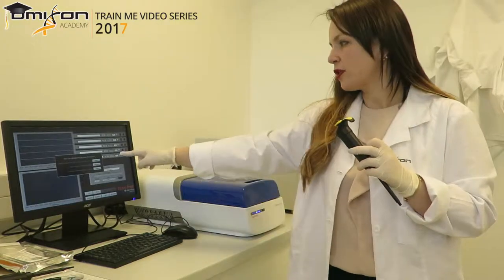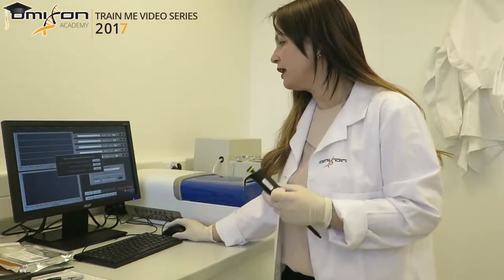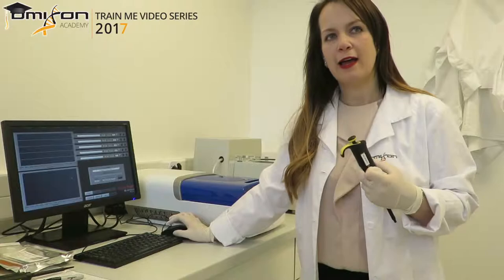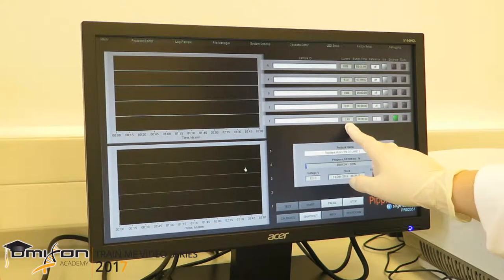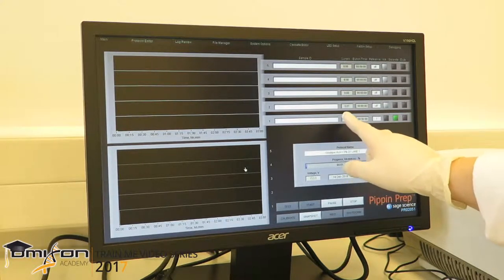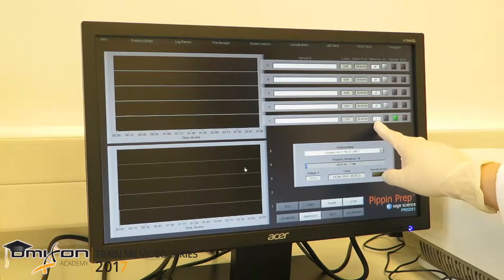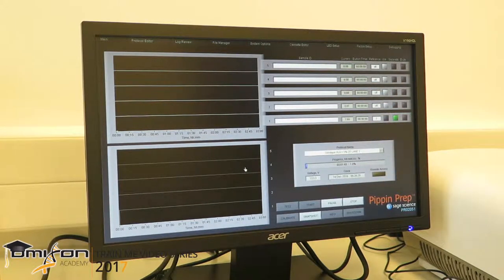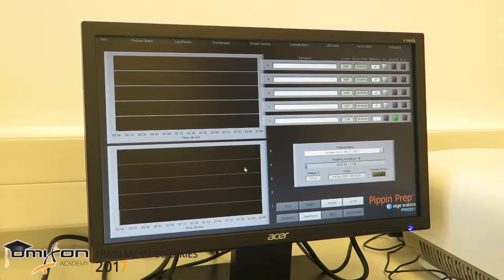Once we click start, the software asks whether we calibrated the machine and completed all necessary steps. I confirm and click start again, and the run begins. We can see that the current on the lane we are using goes up, while the other lanes remain close to zero because they are not being used. The lane we are using is also the reference lane, as we told the machine. The progress bar has started counting — the runtime is between 42 to 45 minutes, depending slightly on the machine.